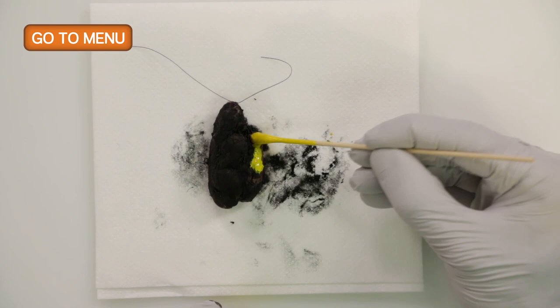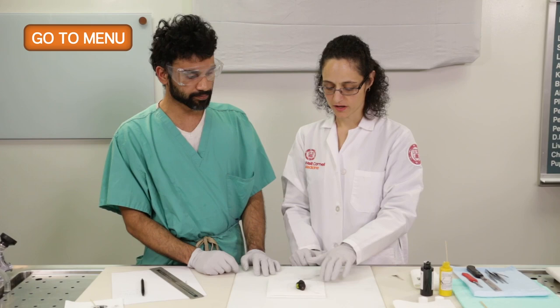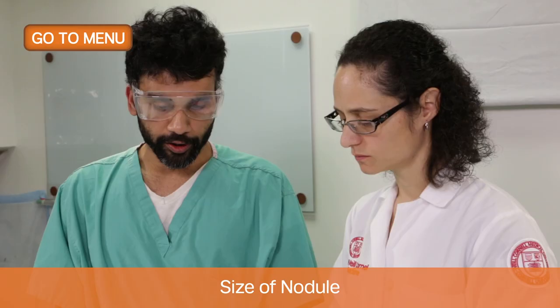All right, so now that I've finished the inking, what should I do next, Teresa? Okay, so what do you want to know about the size, potential size of the nodule in the lobe? Right, so I guess I want to know where it is, and I also need to know what the size is, as you mentioned, and then what has been done to it before.